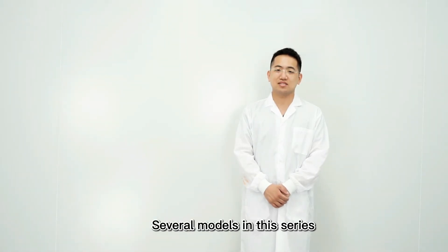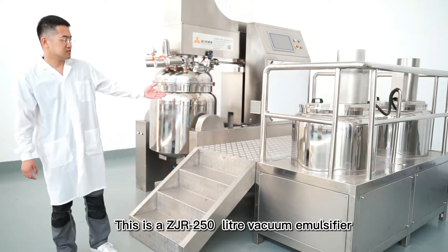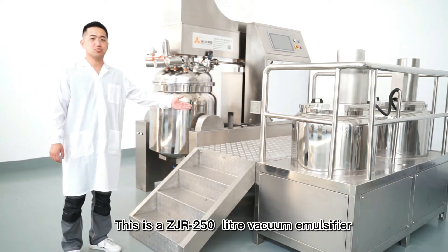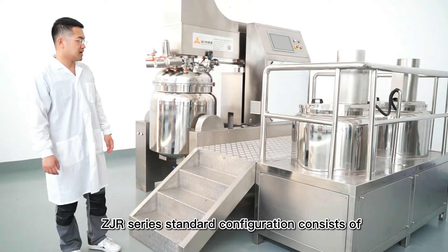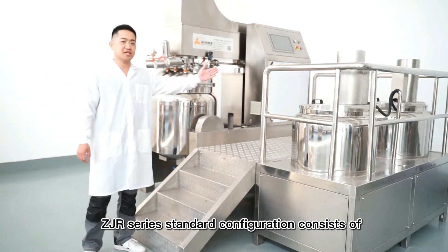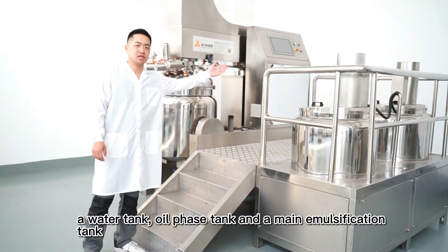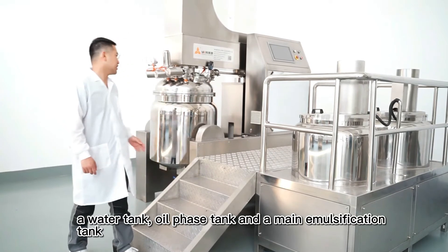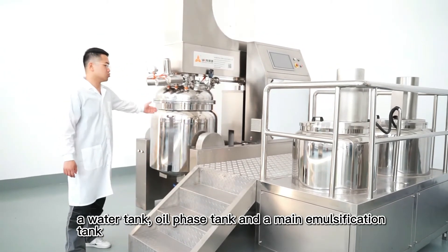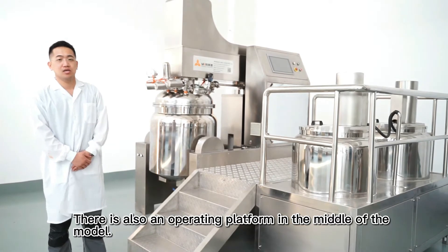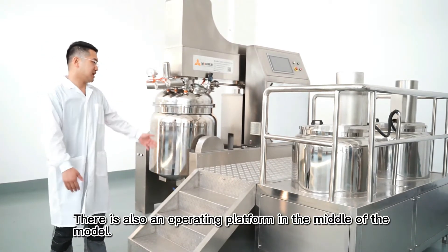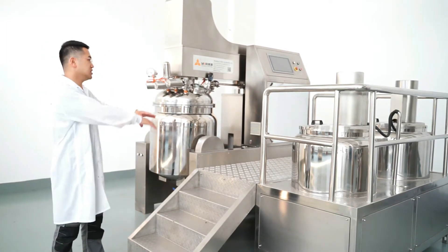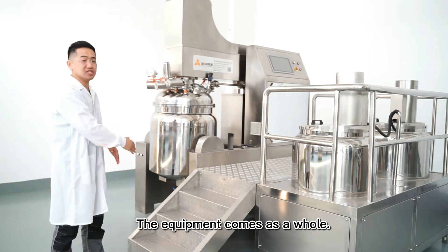Let's take a look at several models in this series. This is a ZJR 250 liter vacuum emulsifier. The ZJR series standard configuration consists of a water tank, oil phase tank, and a main emulsification tank. There is also an operating platform in the middle of the model. The equipment comes as a whole.